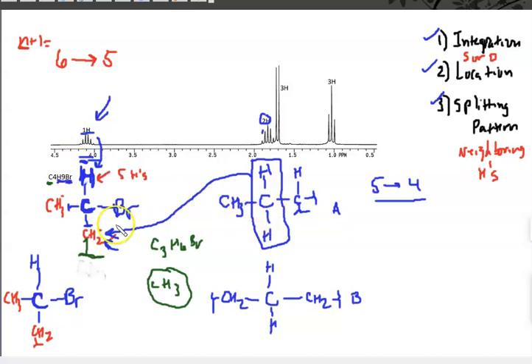So what you're doing is overlapping these fragments, trying to figure out where these fragments are on the other fragments I'm making. So that CH2 is that CH2. This CH is for that CH. And this is telling me what is next door in this green area. So this is telling me that I have a CH3. It's confirming I have a CH3 based off of that splitting pattern. Okay? So it's kind of a puzzle. This is a puzzle. What you're basically doing is analyzing each peak. Then you have to piece them all together and find out where they overlap each other.